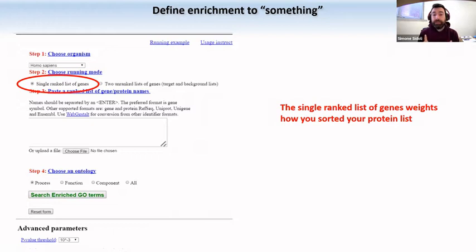And this is dangerous. You have to be careful because ultimately you want to know which proteins are regulated by my drug treatment, right? But if you are doing this experiment with myotubes, for example, both your upregulated proteins and your downregulated proteins are probably proteins that are involved in muscle cells. There's probably myosin everywhere, regulated or not. Especially if you are not very sensitive with your experiment, you're always going to have a bias of proteins that you can see in your model system.